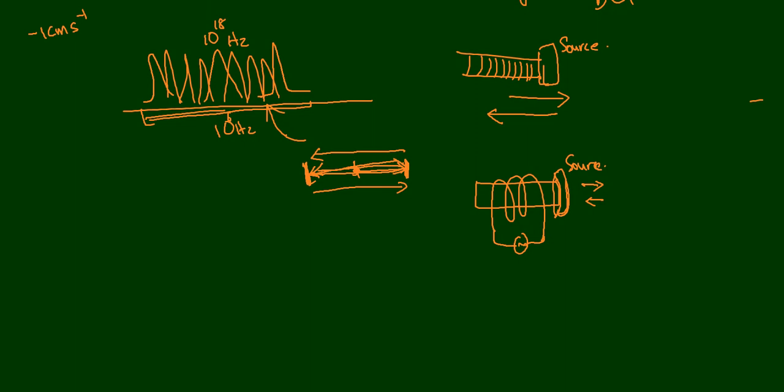So the multi-channel computer can detect at which position of the source, and at which velocity of the source, what is the absorption of the radiation. So this is much simpler than the other one. This can be electronically controlled, and the multi-channel computer will give the information.